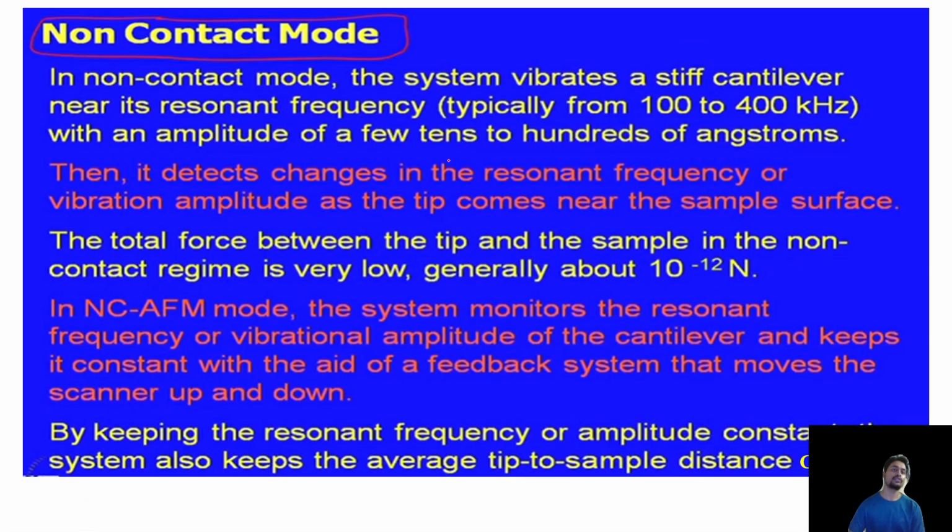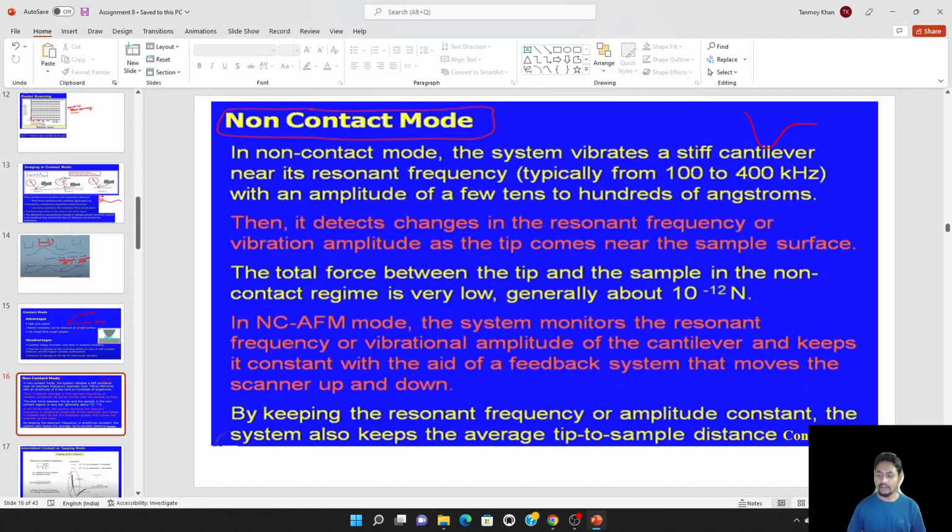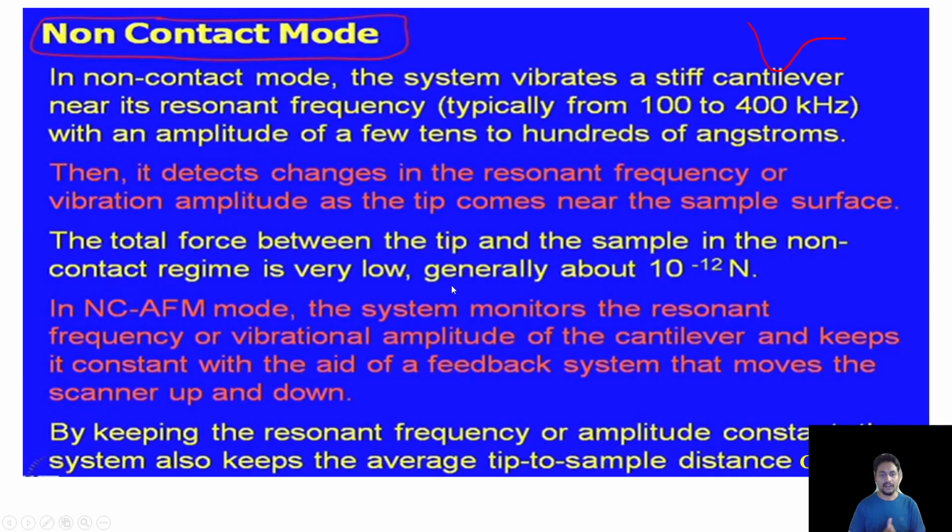So now there is also the non-contact mode. Let me tell you one thing. In this class, I'm discussing AFM. Then I will solve the questions of assignment 8, right?